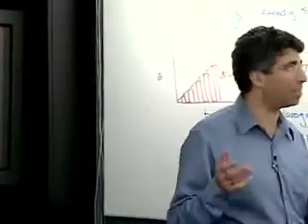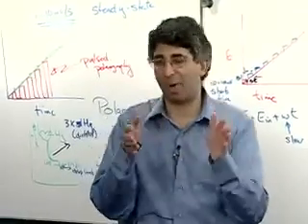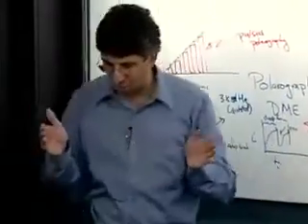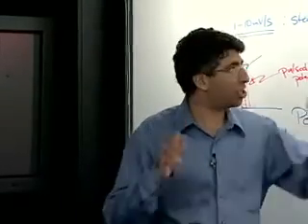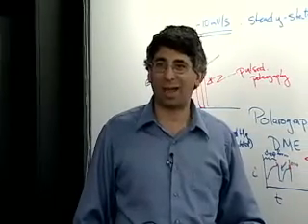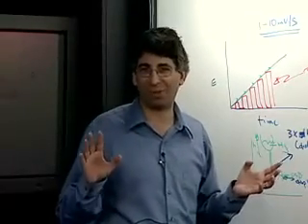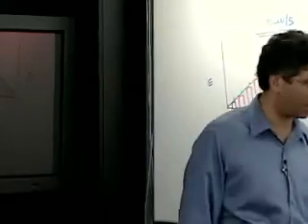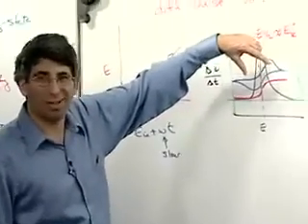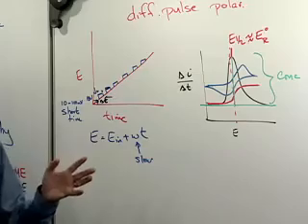There has been some work done looking at various mechanisms and seeing how the waves either move in position or broaden with the mechanism. But even if you were going to do that, you run into the standard problem that you run into, say, with chronoamperometry, and that is the shape of the curve that comes out does not have any significance to the eye. There is no pattern recognition going on there where you could look at it and say, oh, look, it shifted over to an EC mechanism based on the scan rate dependence or something like that. Because you're talking about subtle changes in the width of the curve. And of course, there are a variety of reasons why a curve might broaden out: changes in resistance, changes in mechanism, et cetera, et cetera.